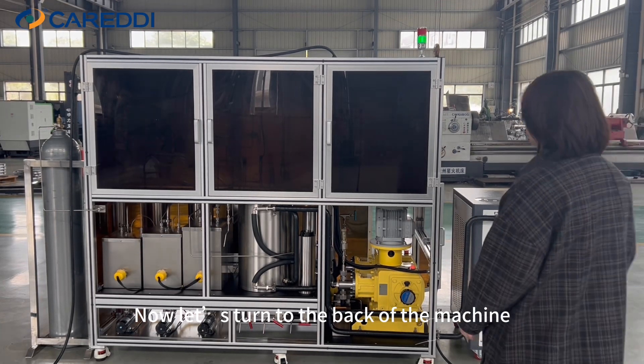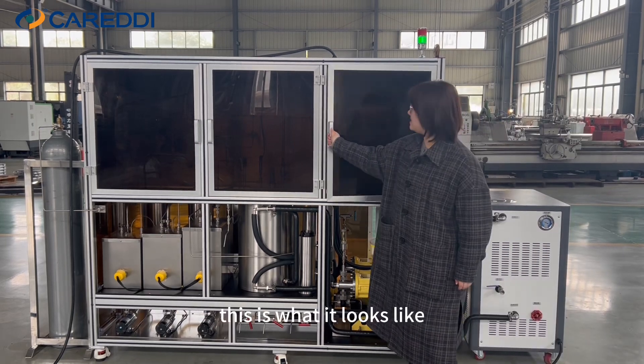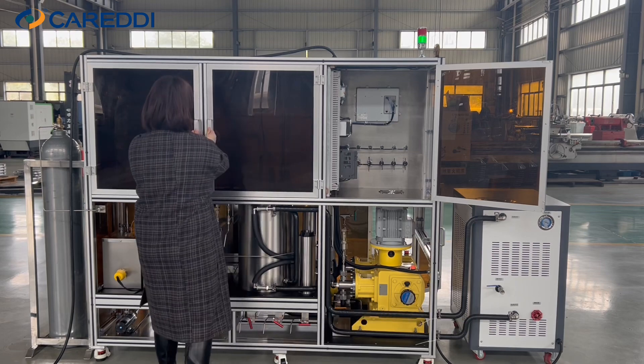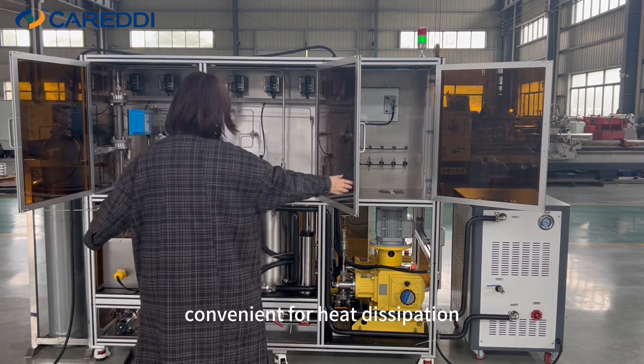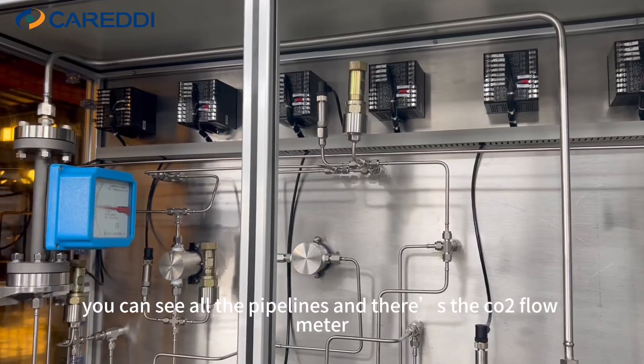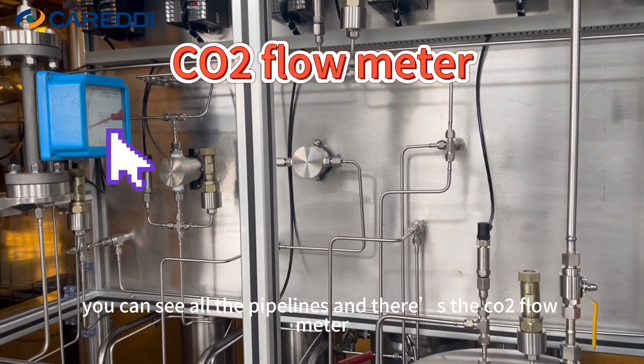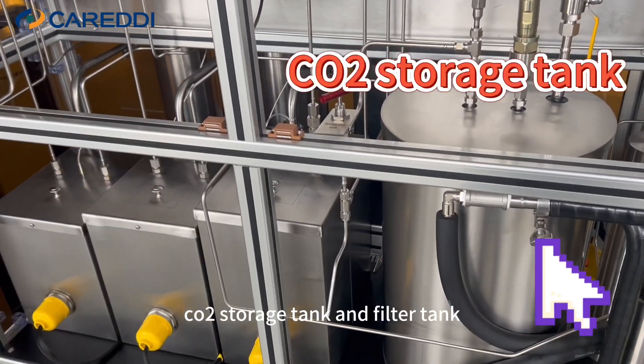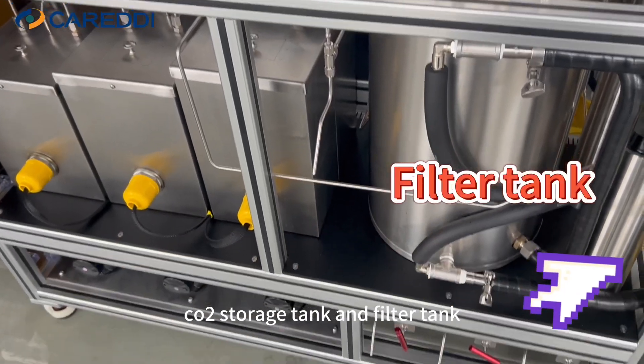Now let's turn to the back of the machine. The cabinet door can also be opened, convenient for heat dissipation. You can see all the pipelines, and there's the CO2 flow meter, water tank, CO2 storage tank, and filter tank.